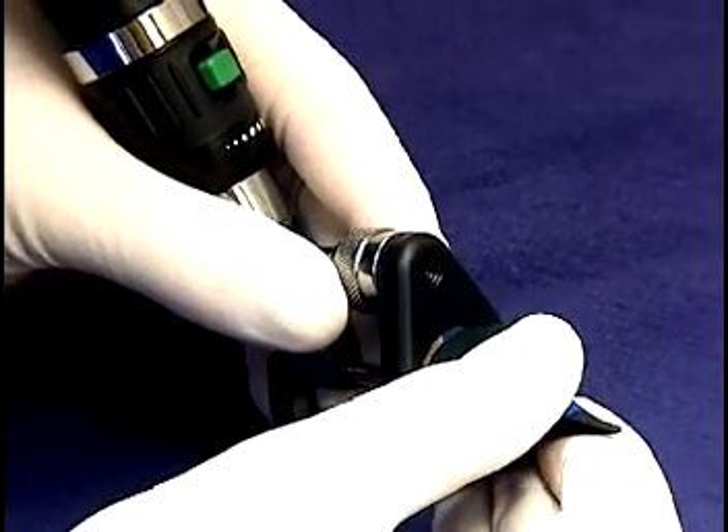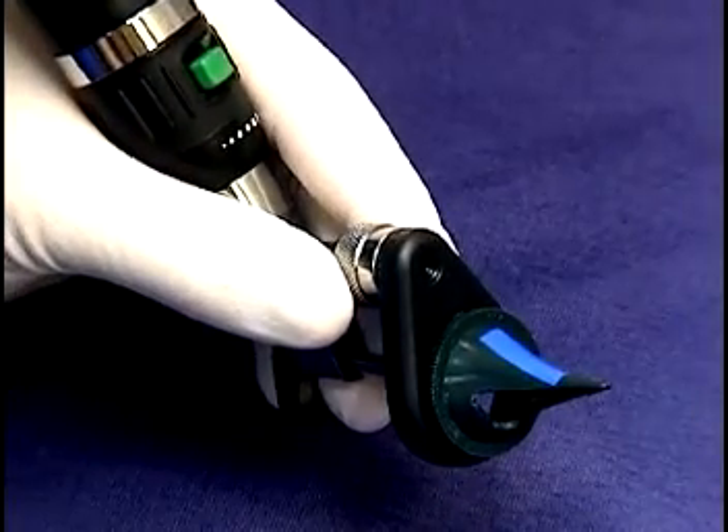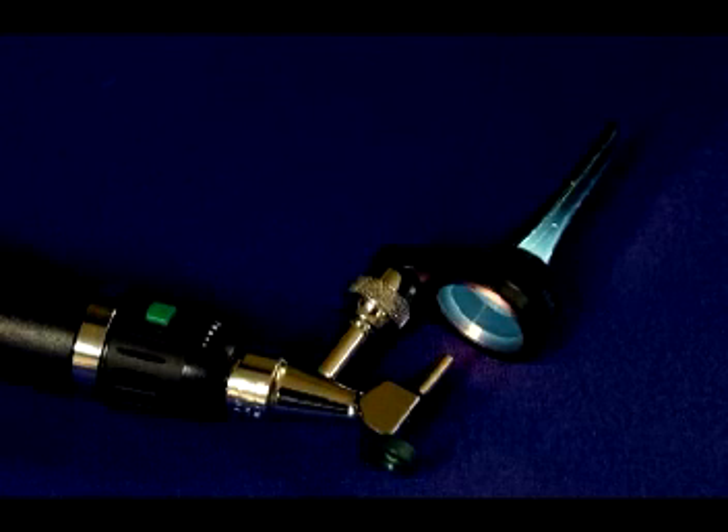Next, the speculum is mounted on the otoscope. Remember that the otoscope handle will be up, not down, during intubation. The speculum is mounted so that the cutaway portion is facing the operator's dominant hand when the handle is held up. In this view, the speculum is correctly positioned for a right-handed operator. This part is specially molded with a cutaway to allow side access and it is autoclavable. It will fit either a Welsh Allen or an MDS operating head otoscope. Although there is a place reserved in the mouse pack for the otoscope, one is not provided with the pack because many people already own one. If you do not, they are available from Hallowell EMC.